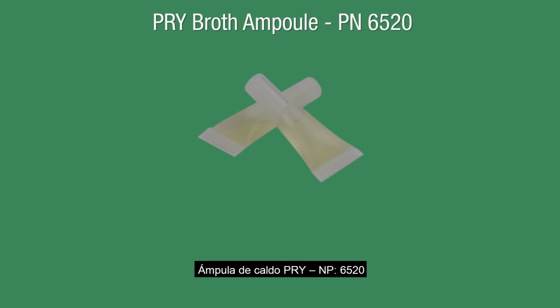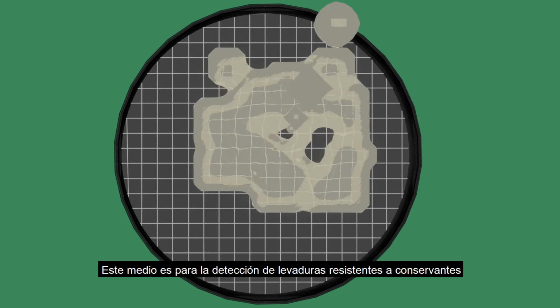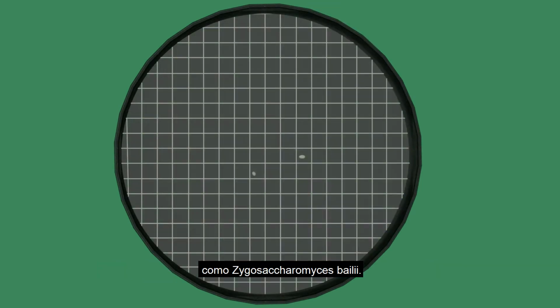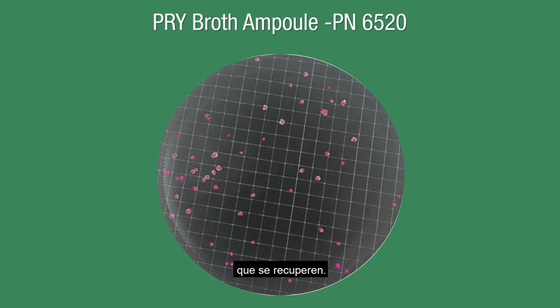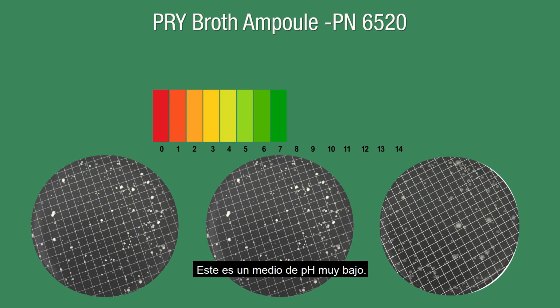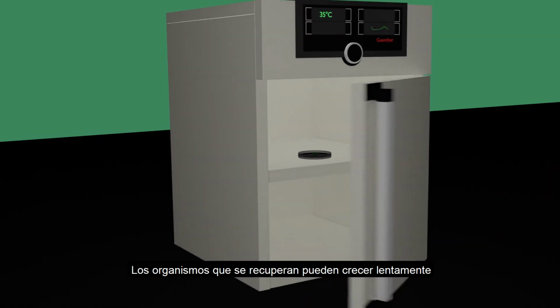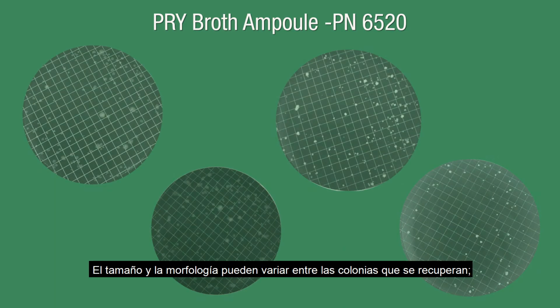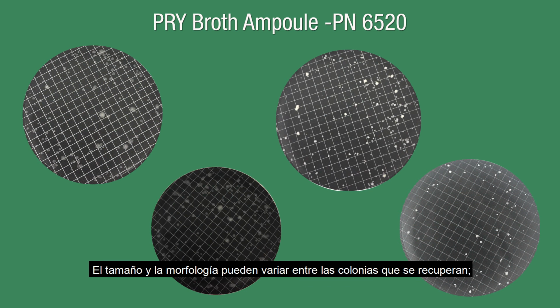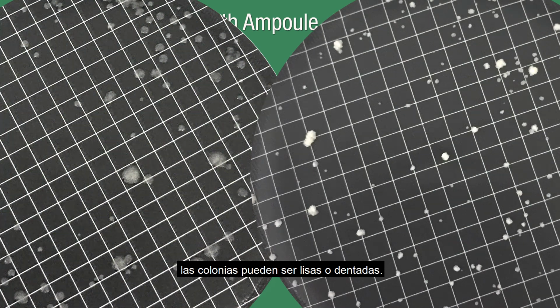PRY broth ampule. This medium is for the detection of preservative-resistant yeast, such as Zygosaccharomyces bailii. To interpret results, count all white to off-white colonies that recover. This is a very low pH medium. The organisms that recover can be slow-growing and may require up to 3 to 7 days of incubation. Size and morphology may vary for colonies that recover. Colonies can be smooth or jagged-looking.